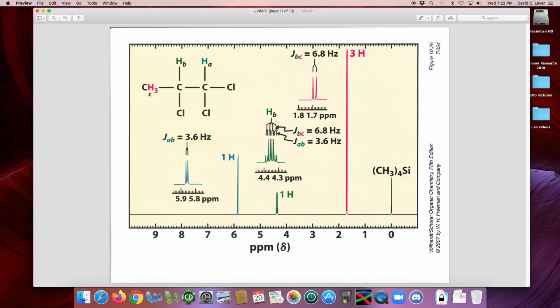So each of the peaks of that quartet that you would normally see from the CH3 is split into a doublet. So we get a doublet on the outer, and then the 2 inner peaks are split into doublets, and then a doublet on the outside. Again, this isn't a very good picture. You really ought to have 4 branches in your tree, for 4 adjacent hydrogens, and they're showing the quartet with just 1 branch rather than showing 3 individual branches with the overlap, which is what you would expect to see. So we've got a 1 to 3 to 3 to 1 quartet, followed by peaks 1, 3, 5, and 7 on this 8-peak multiplet, and then we've got a 1 to 3 to 3 to 1 quartet shown by peaks at 2, 4, 6, and 8.